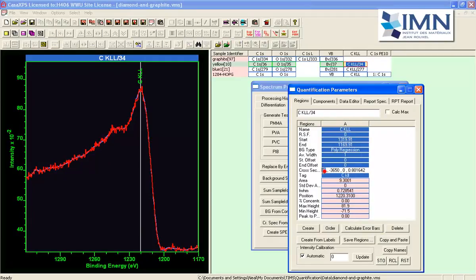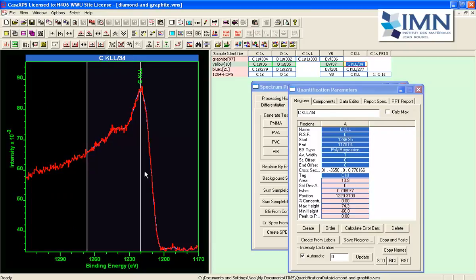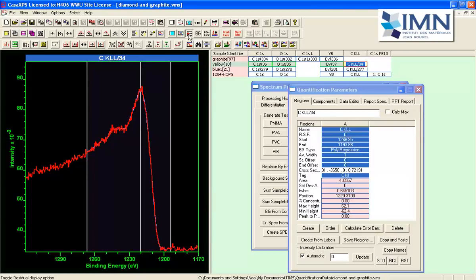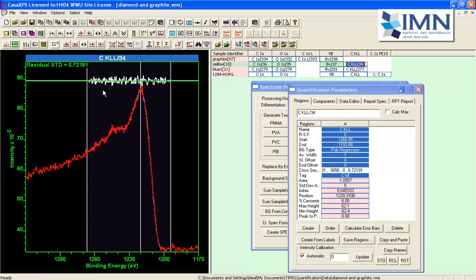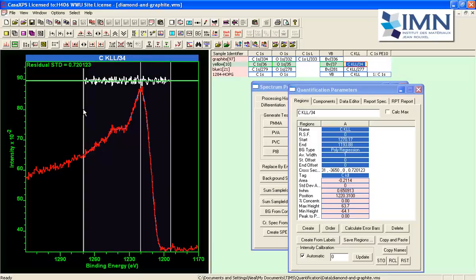It's still got the same cross-section parameter in the first parameter so that's the degree of the polynomial and again we can adjust the region limit so that the approximation is a fairly good approximation of the data.